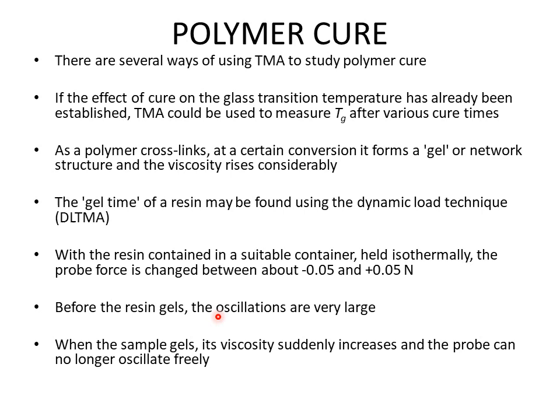The probe oscillates quite freely, and when the cross-linking starts in the polymer, its viscosity suddenly increases, and the probe can no longer oscillate freely.